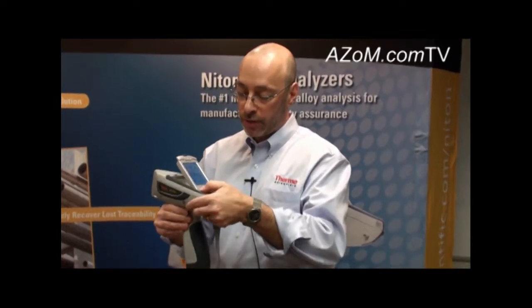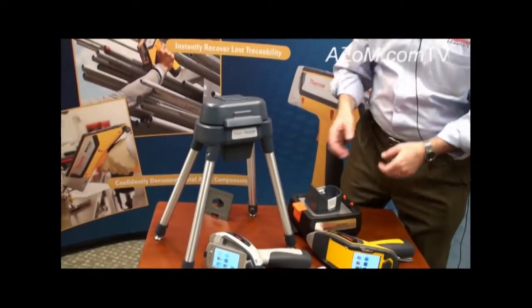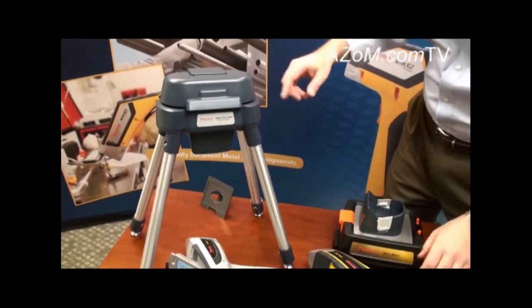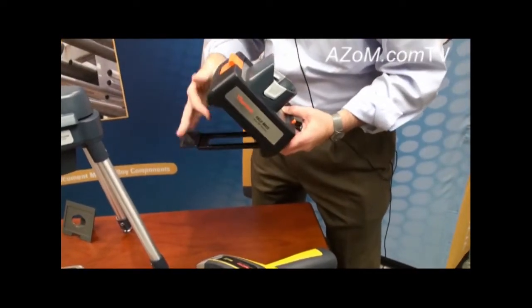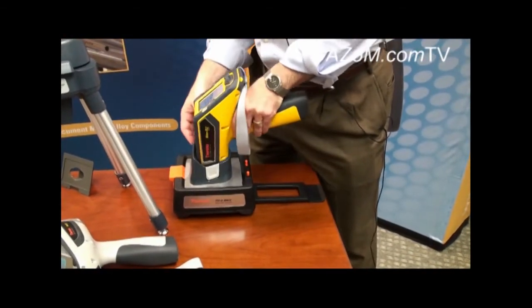Both products are available with a range of accessories. Here on the table we have a couple of different test stands — we have the Field Mate as well as the Thermo Scientific Mobile test stand. The instruments clip right into the test stands and permit users to take measurements of samples that have been either lightly prepared or more heavily prepared.